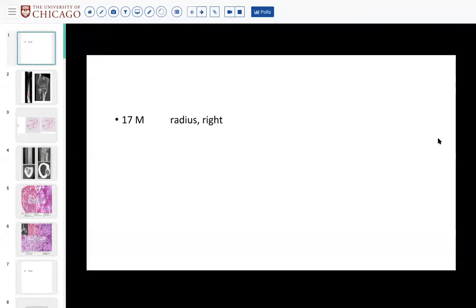And if you are ever uncertain if something is benign or malignant, always defer, because if you give a malignant lesion a benign diagnosis and they curettage, they contaminate the field and basically preclude the patient from having limb sparing surgery in the future, right? So they more often have to do an amputation then. So that's the one reason why frozen is so critical. And if you're uncertain, defer.